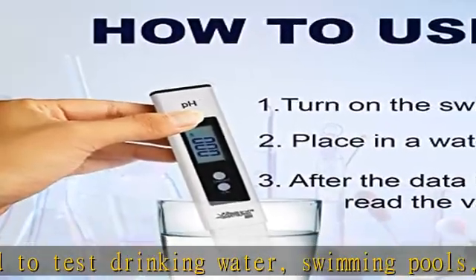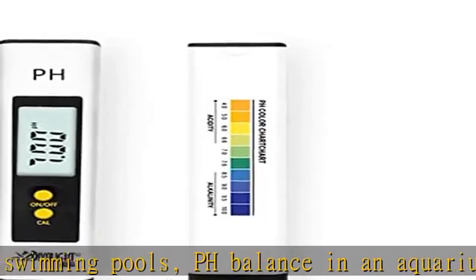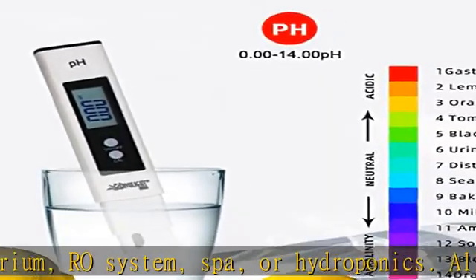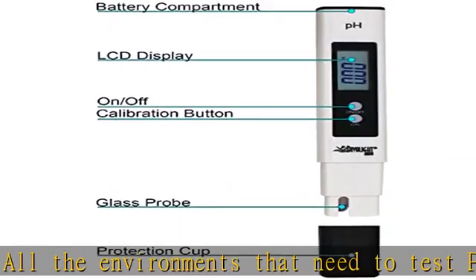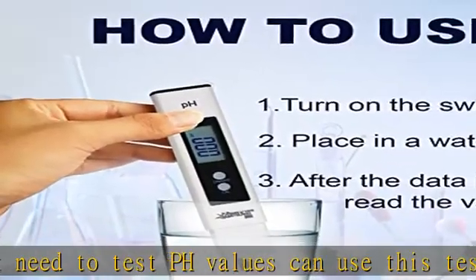To get accurate data, use this tester. For calibration, place the tester in a calibration solution, press CAL for three seconds to enter calibration mode, and press in turn to select the powders corresponding to 6.86, 4.00, and 9.18 to complete the calibration.